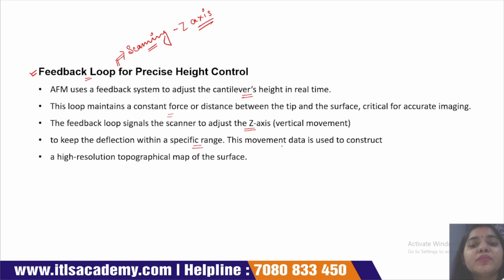This movement data is used to construct a high resolution topographical map of the surface.